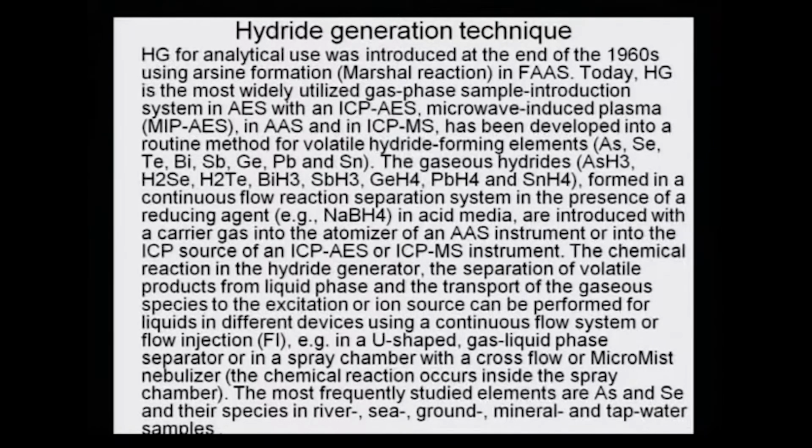Today, hydride generation is the most widely utilized gas phase sample introduction system in AES with an ICP-AES, microwave induced plasma, that is MIP-AES, in AAS and in ICP-MS. So, it is popular now in all types of these metalloid analytical methods, ranging from AAS to AES to ICPs and ICP-MS. And these have been developed into a routine method for all volatile hydride forming elements.